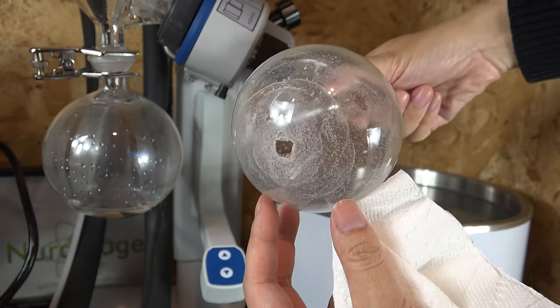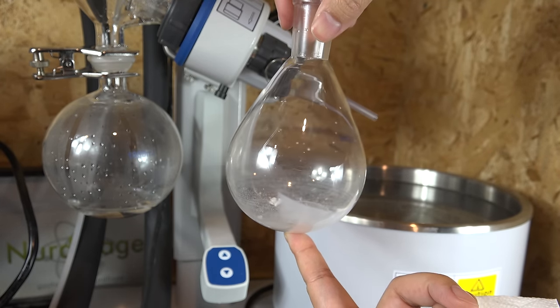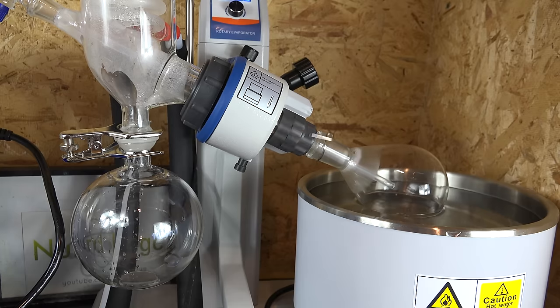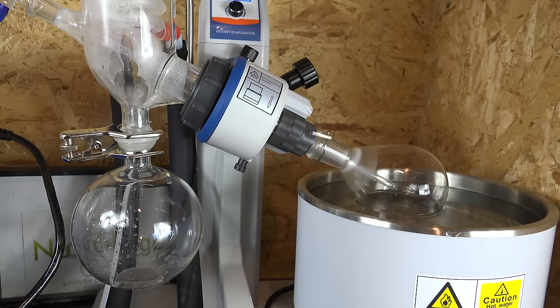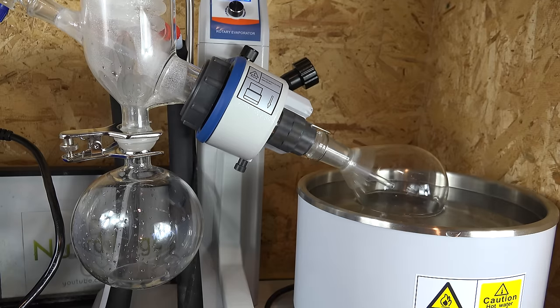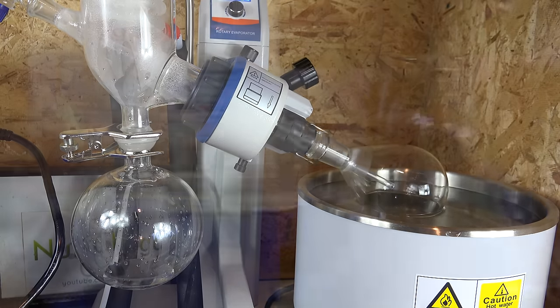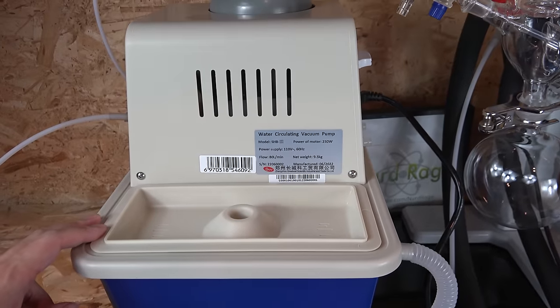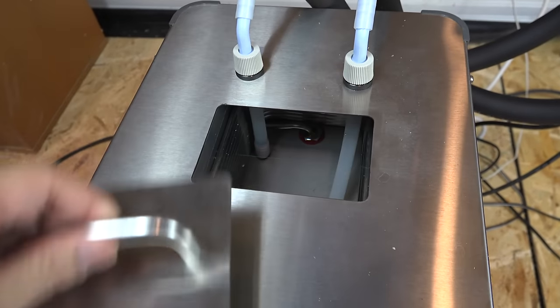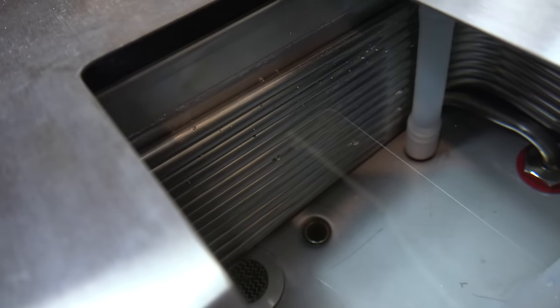You can see why rotovaps are big business and why many labs have them. The time of a chemist is very valuable and can justify spending thousands of dollars on equipment that saves many hours of work per week. Additionally the process is quite gentle, using low heat and high vacuum, so sensitive compounds aren't degraded as they would be if hard-boiled at atmospheric pressure. For amateurs though, this is massive overkill. I want to thank GWSI Labs for gifting me this equipment — I'll be using their professional vacuum pump instead of my amateur aspirator, and this water chiller is really awesome; it can go sub-zero and I'm going to find a way to perform sub-zero amateur chemistry with it, maybe condensing liquid sulfur dioxide.